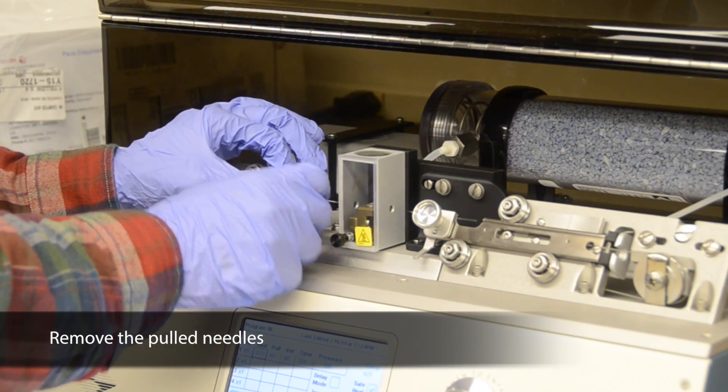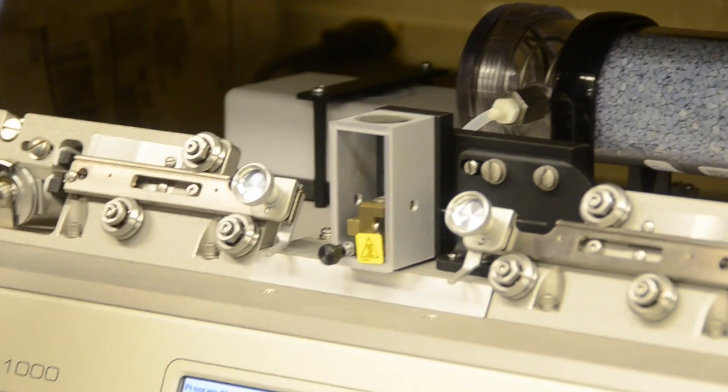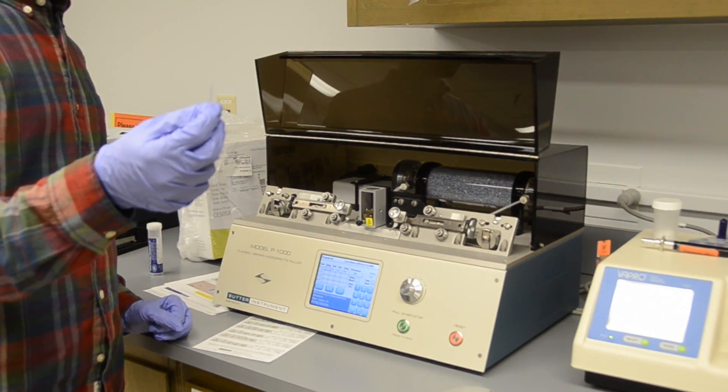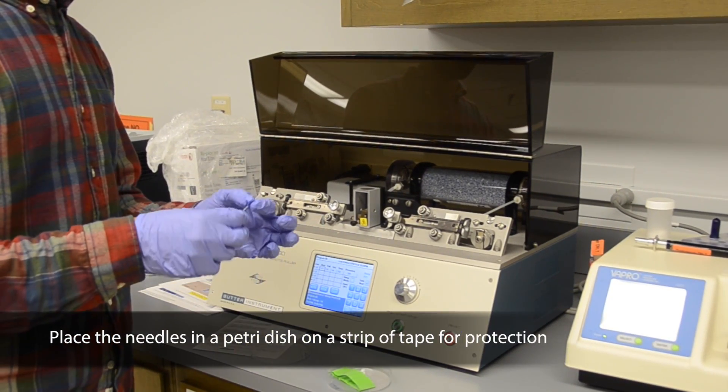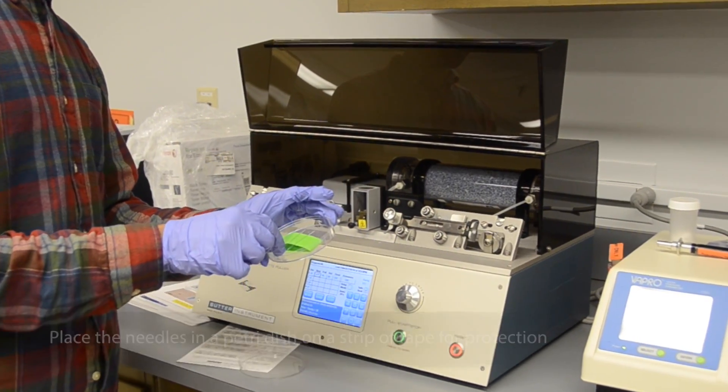Carefully unscrew the capillary tube holders and remove the pulled needles. Place the needles on the sticky side of a piece of tape in a petri dish. This will prevent the needle from breaking.